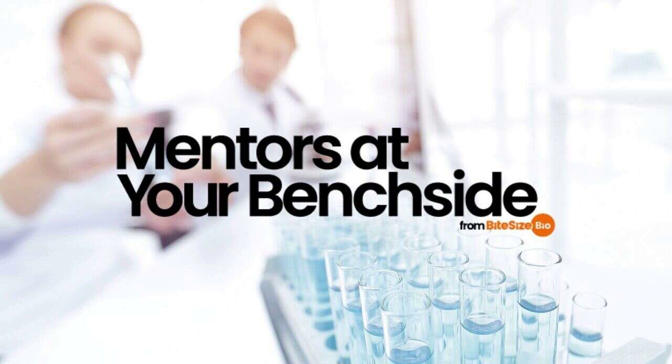I'm Adam Paulson, and today I'll be talking to you about hematoxylin and eosin staining, exploring its mechanism of action and discuss the structures it effectively stains. Histology is the study of tissues and their microscopic structures. It plays a crucial role in biological research, aiding our understanding of cellular organization and pathology.